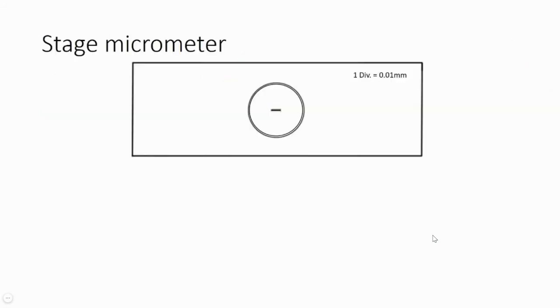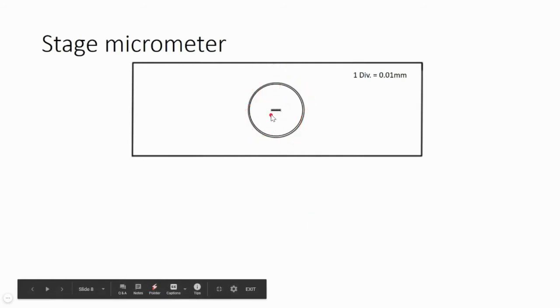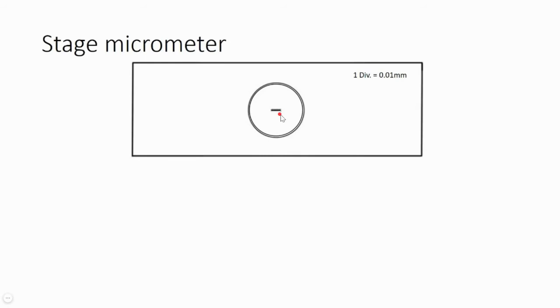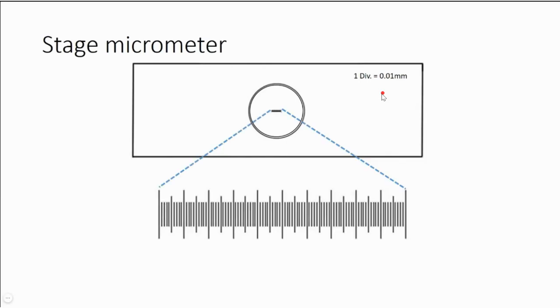Now let's look at the stage micrometer. It is just a special glass slide — special because a tiny scale or ruler is etched in the center, and this scale will appear like a tiny line to the naked eye. Under the microscope, you can see tiny divisions or small lines on this scale. On the top corner of this scale, something is written like: one division equals 0.01 millimeter.